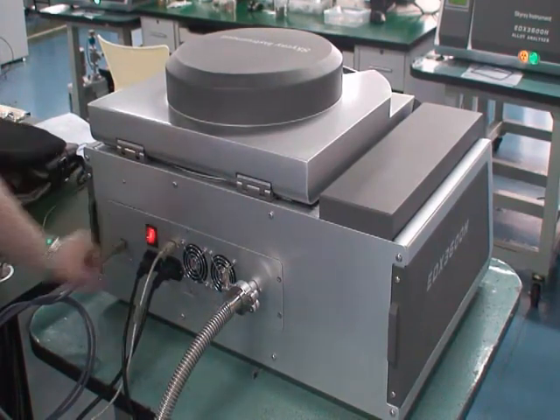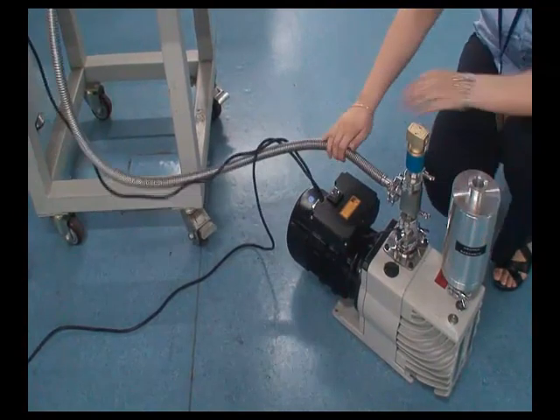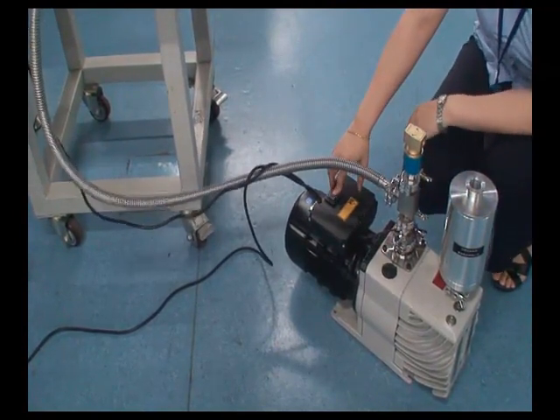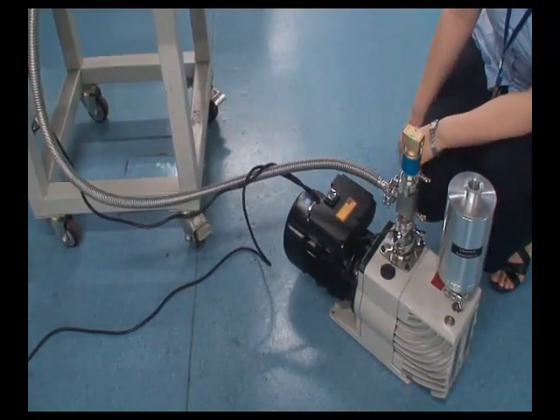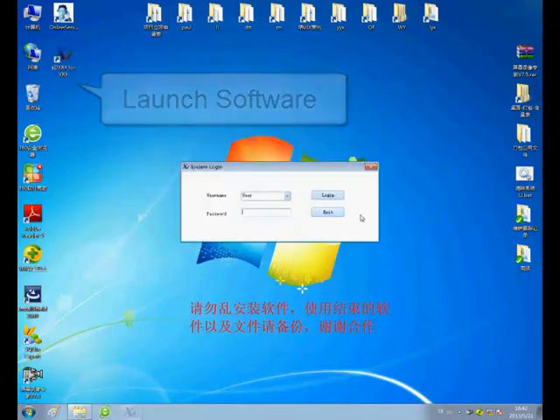Turn on the power and turn on the vacuum pump. Double click the desktop icon to launch the software, then enter your username and password.